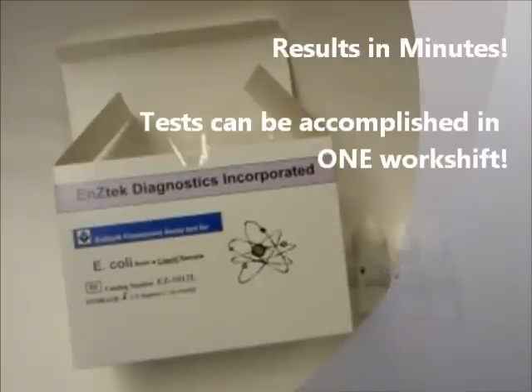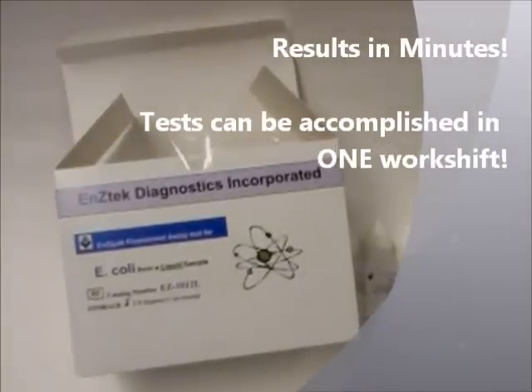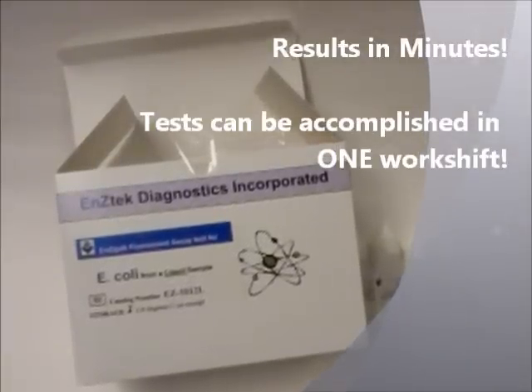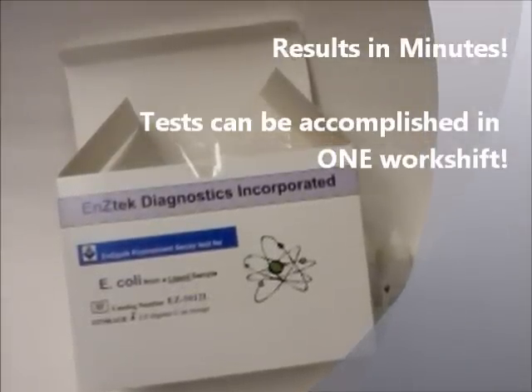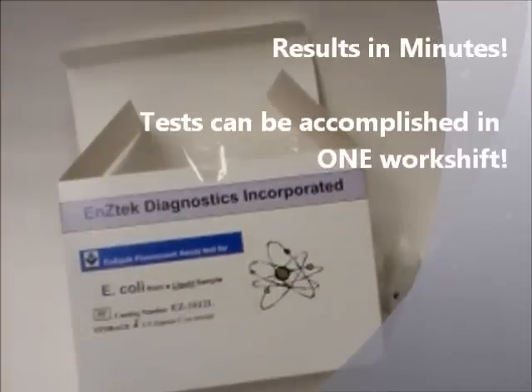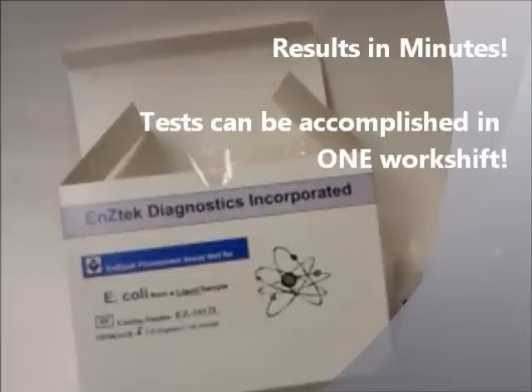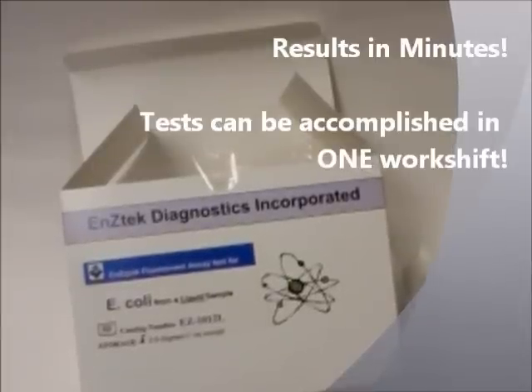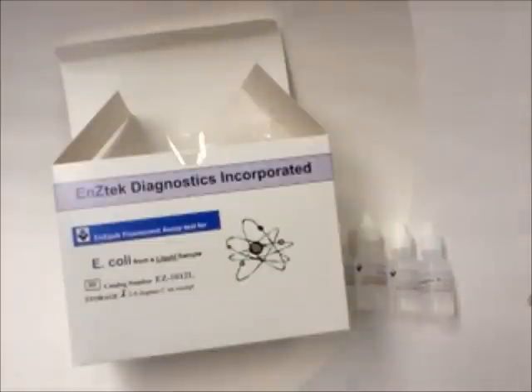In some instances, results can be obtained within minutes of sample collection, but always within one work shift. Even when detecting low levels of bacteria, such as less than 10 cells, detection can still be accomplished within one work shift.